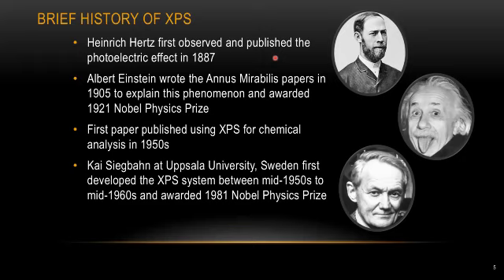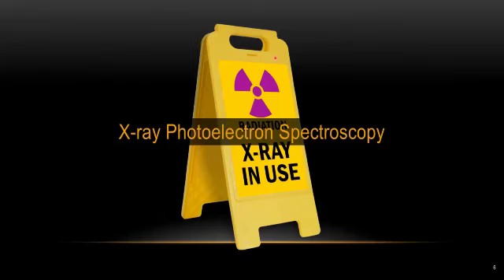And in the next decade, Swedish scientist Kai Siegbahn had been working on developing a fully functional XPS system, and that also awarded him the Nobel Prize in Physics in 1981. Since then, multiple commercial vendors have been developing the XPS system, and with engineering improvements, including data interpretation in the last couple of years, XPS has become a very mature and established chemical analysis tool. In fact, XPS is the most common surface chemical analysis tool. So that's just a brief introduction. Now we can start to dive into the ocean of XPS.